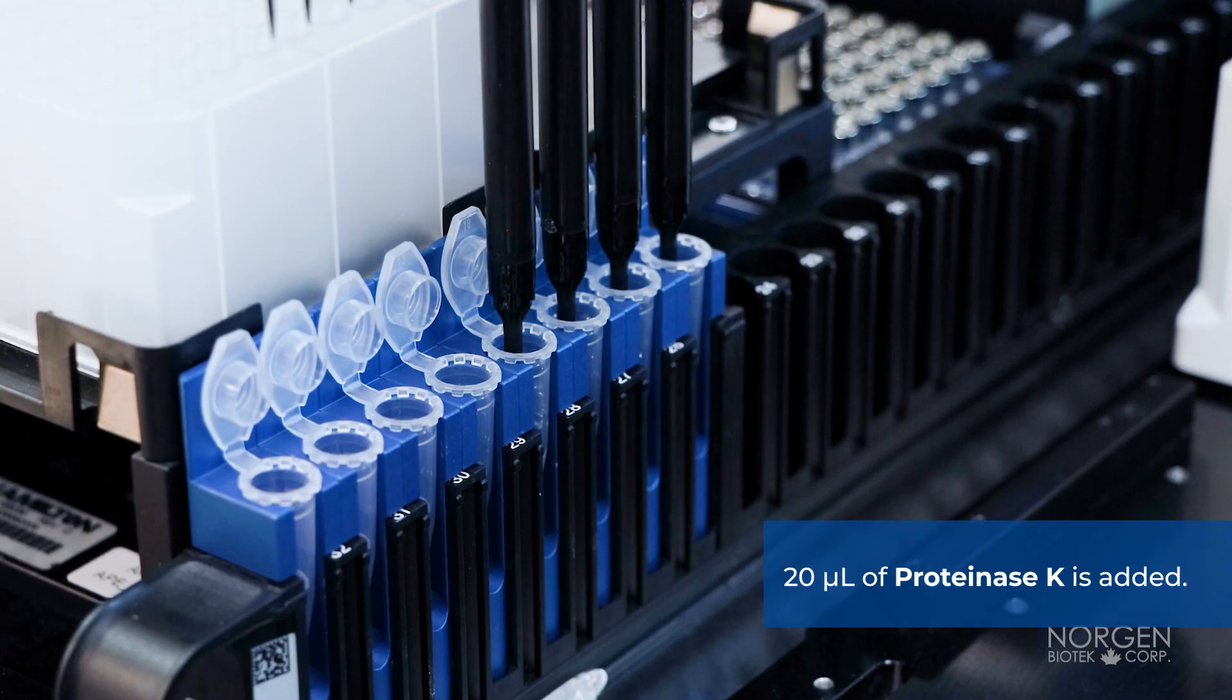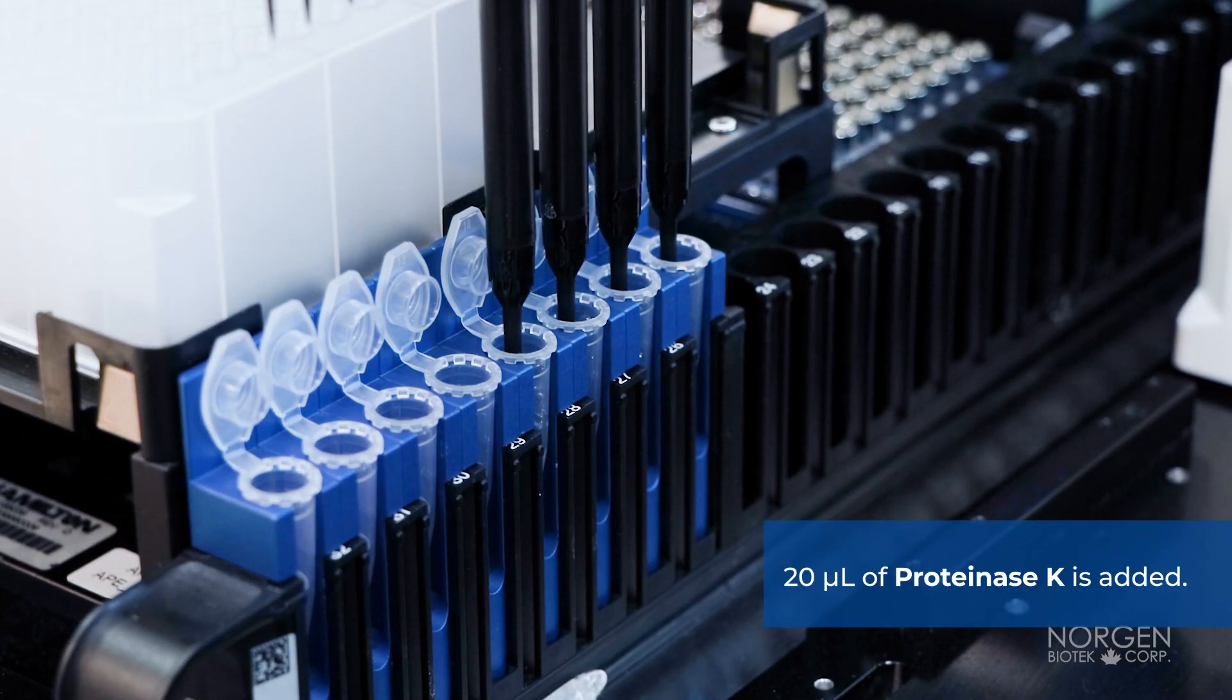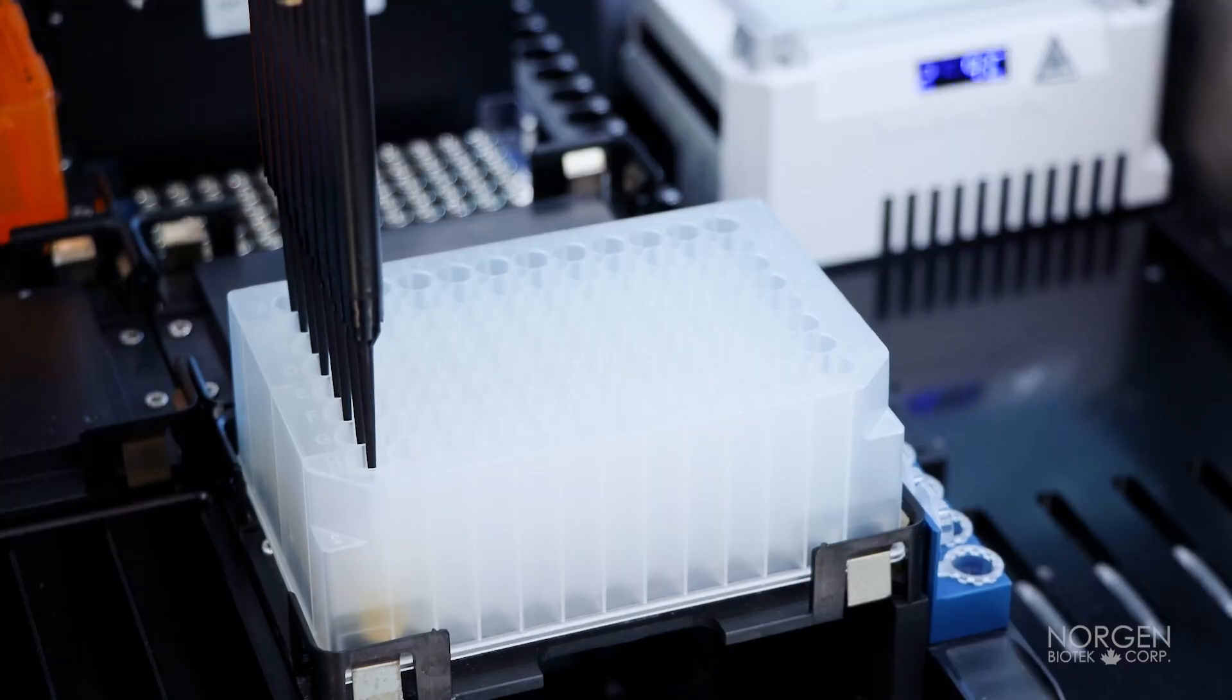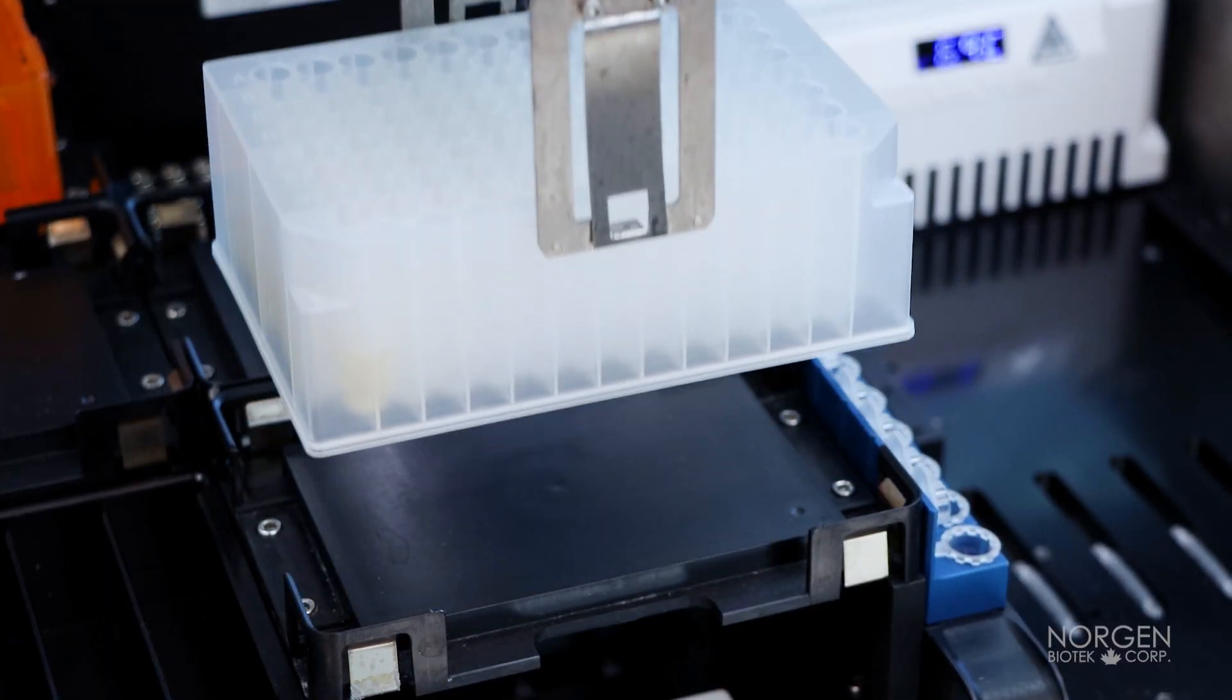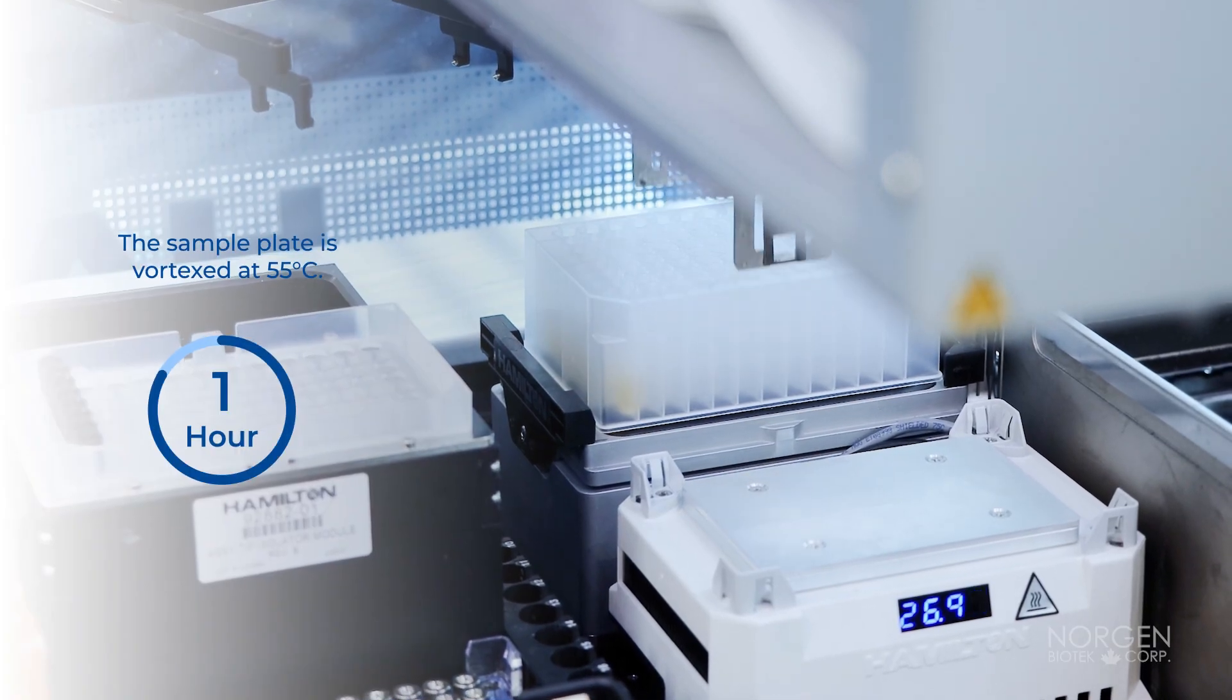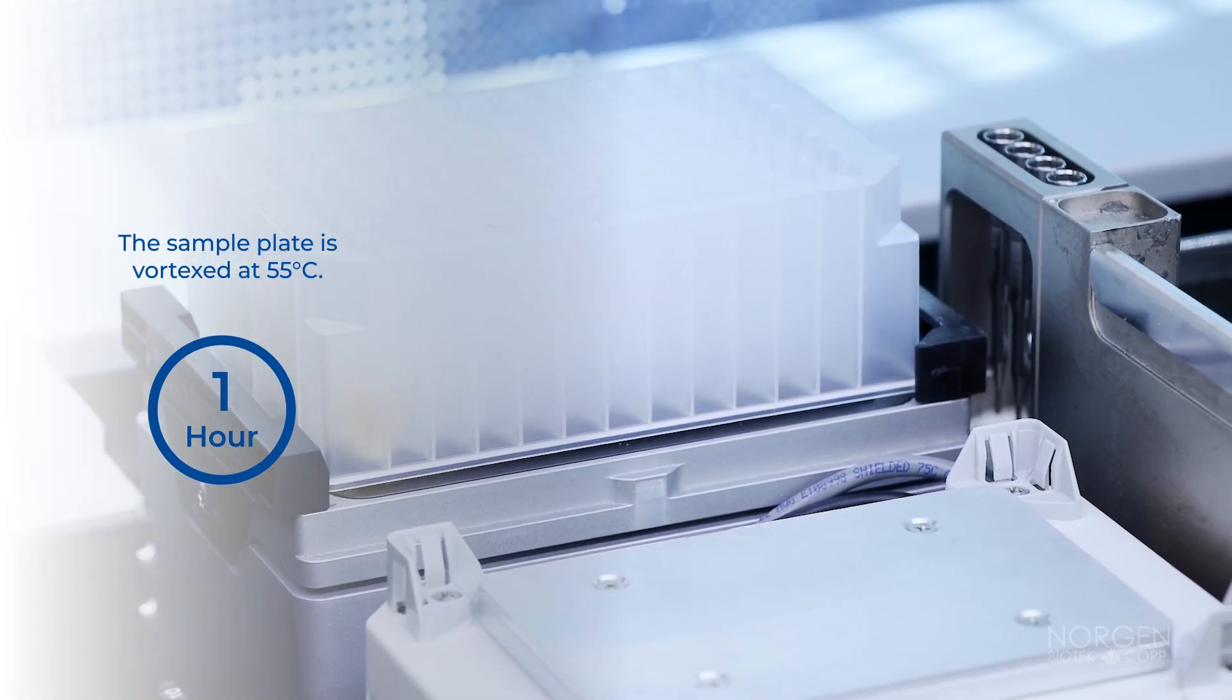Then 20 microliters of Proteinase K is added. The sample plate is transferred to the heater shaker and vortexed at 55 degrees Celsius for one hour.